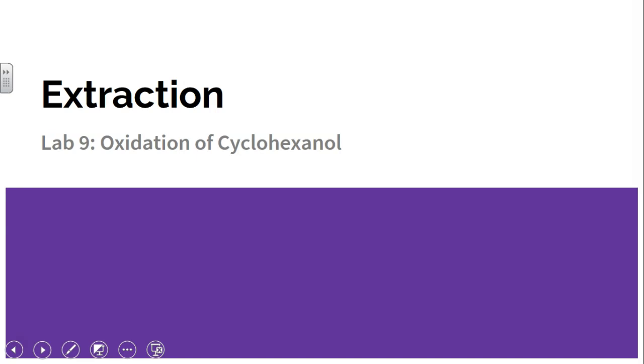Hey everybody, I wanted to spend a little bit of time discussing extraction and what extraction looks like, and I'm going to use Lab 9 as kind of the basis for what extraction should look like for you, but this is a general video on how extraction should be performed regardless of the lab that we're doing. So let's take a look.